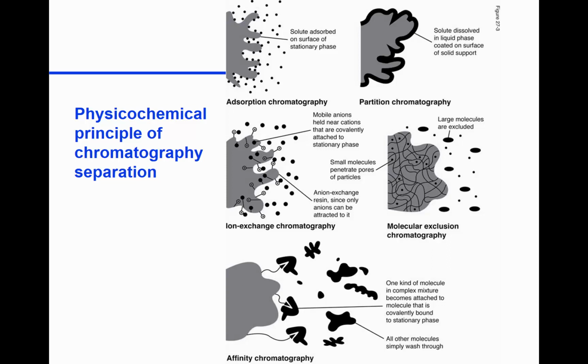Affinity chromatography is another form of adsorption chromatography, but it's a very specific interaction. It's like the interaction of a substrate with an enzyme, lock and key. It's very specific. Antigen with an antibody. It really is very specific to the molecule. So only the one molecule with the structure that binds to that particular ligand will bind, and anything else will not bind at all. So you are here selecting. You're not separating multiple. You are separating one particular compound from a mixture.